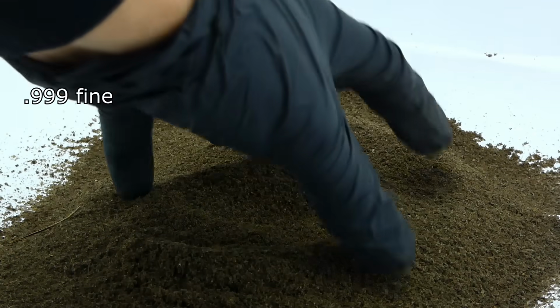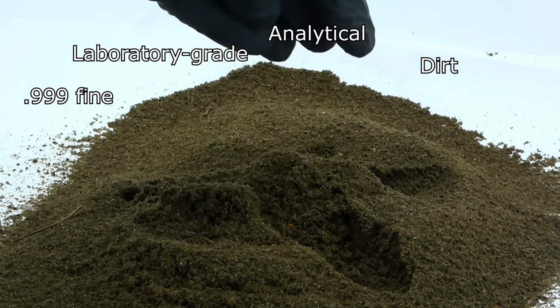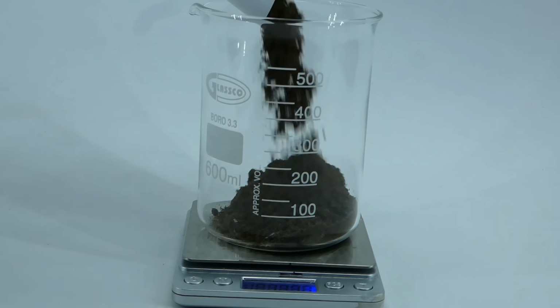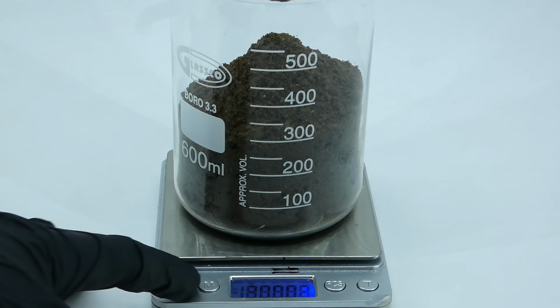left with 0.999 fine laboratory grade analytical dirt, and before I go and process it, I firstly wanted to weigh it to calculate how much silicon dioxide I got out of it later on. I weighed out 300 grams of it and proceeded to use them for the extraction.